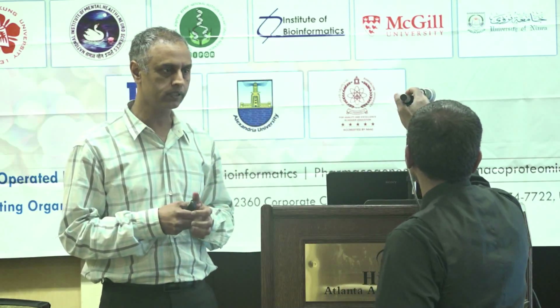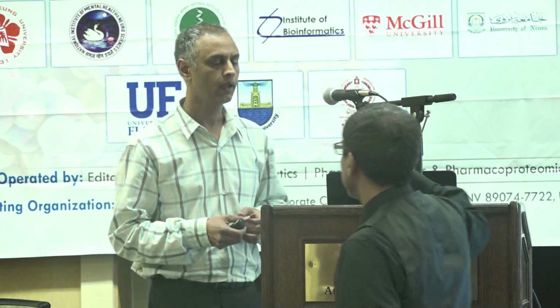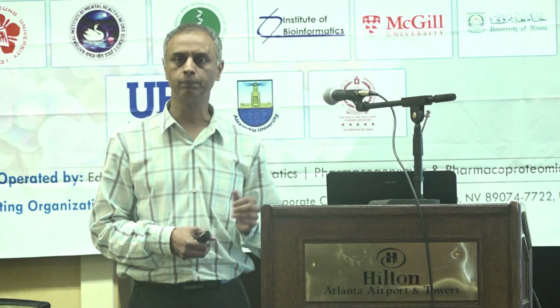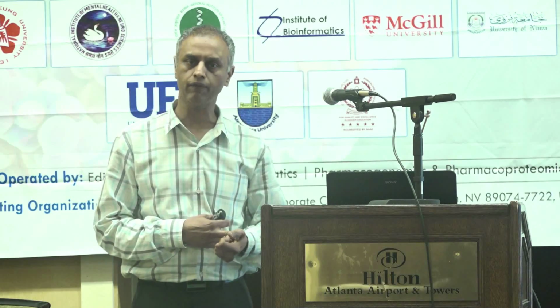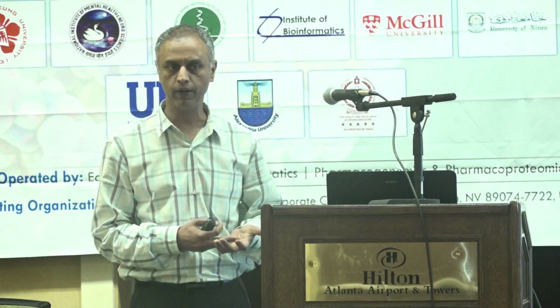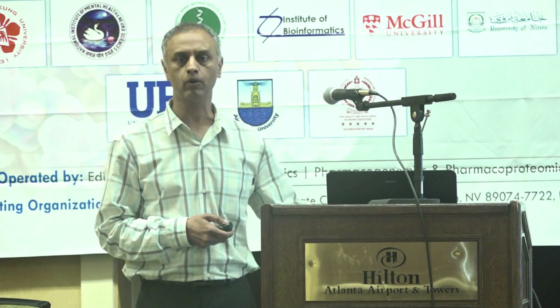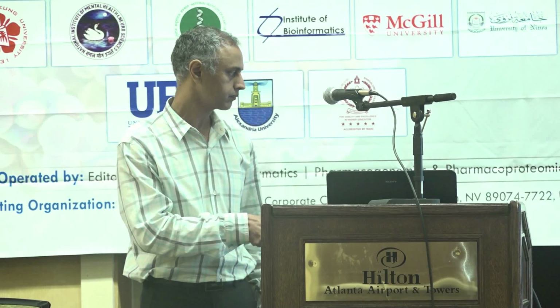But really what bothers me is that there are lots of issues with both false positives and false negatives. And often we are relying on data given by the manufacturers of the mass spectrometers about what those numbers are.